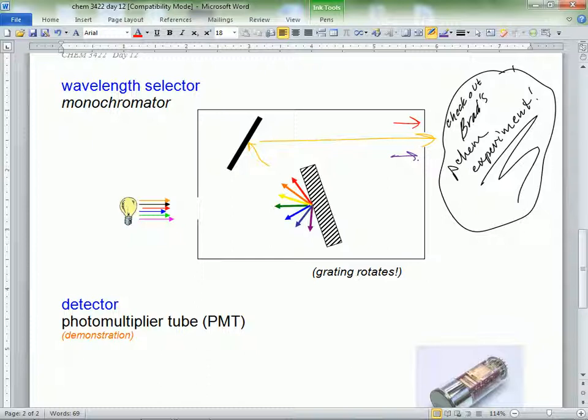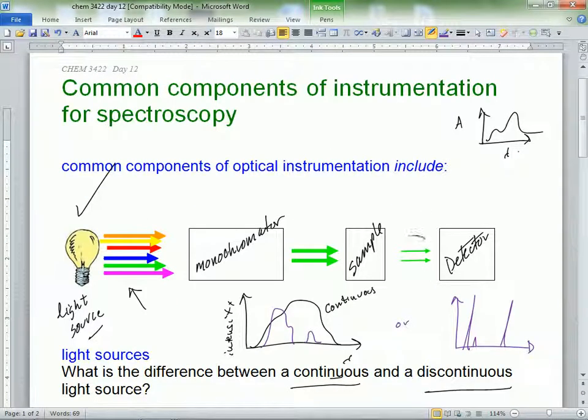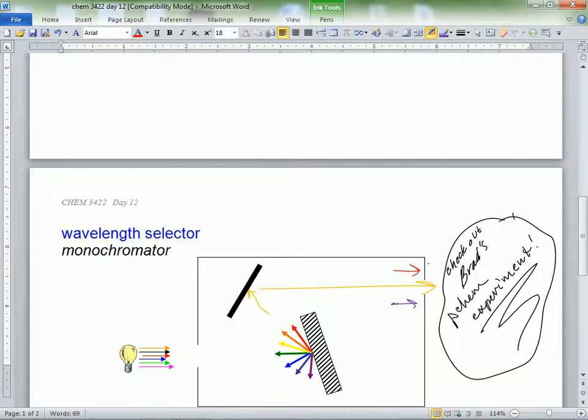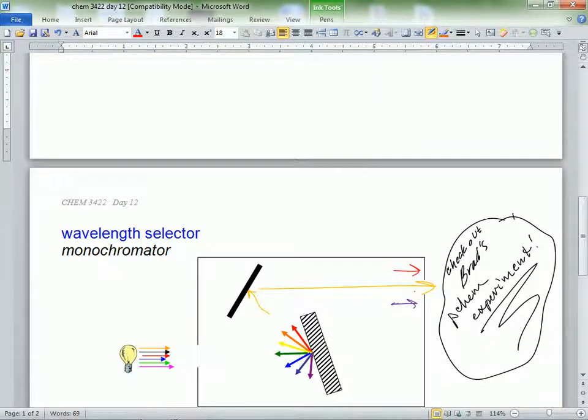So when I was referring earlier about how I wish I could make these two colors a little bit different shaded, yeah, it depends on that slit width. Because what if that slit is a little bit wider? I'll get different colors of orange here. Oh, here's another orange, right? Some more, depending how that slit width is.